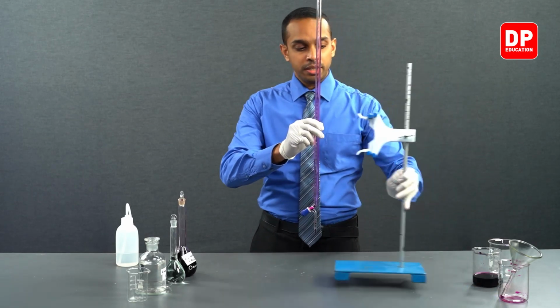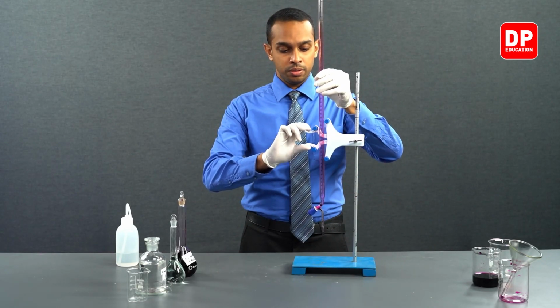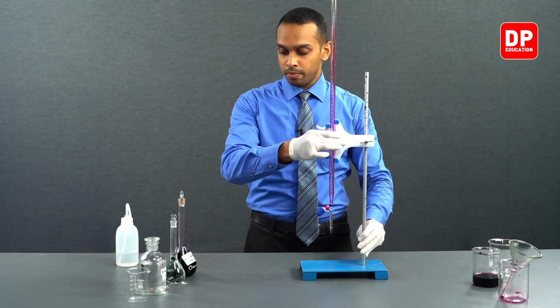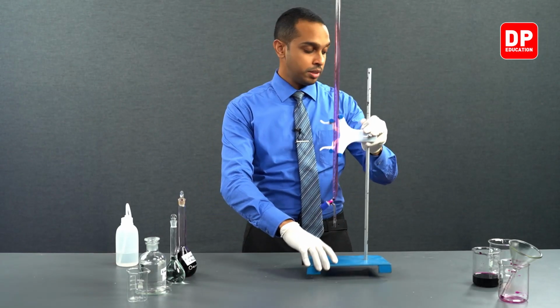After washing the burette, we will again fix it onto our burette retort stand, and we will move it back onto a shorter table.